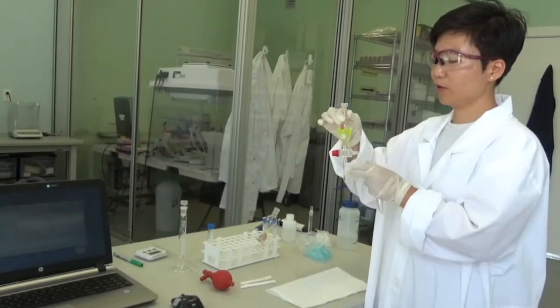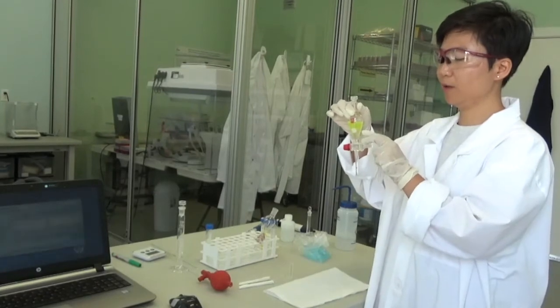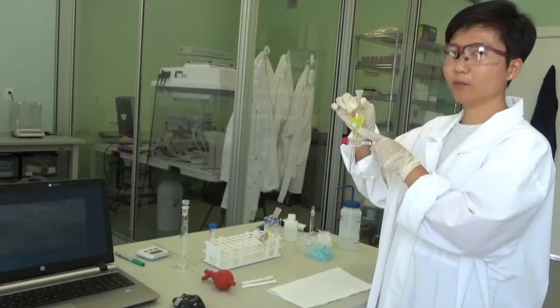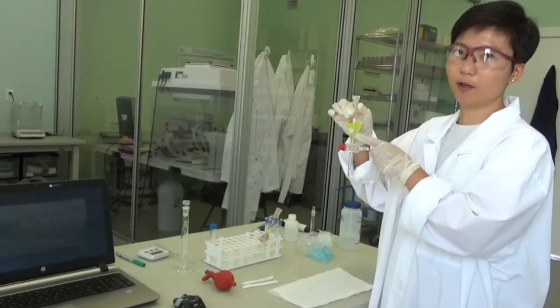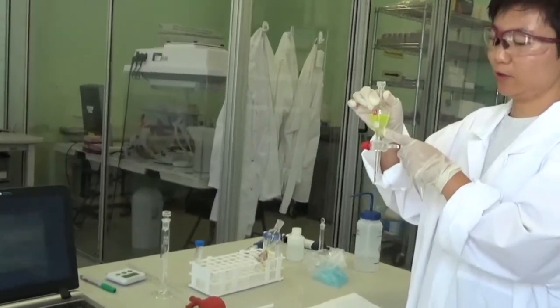So after extraction, we wait till the 2 layers have been separated, and the bottom layer is the chloroform layer, and that has the anionic surfactant that's been extracted.